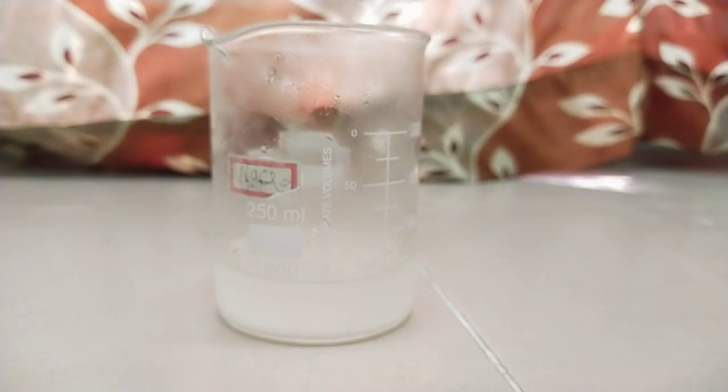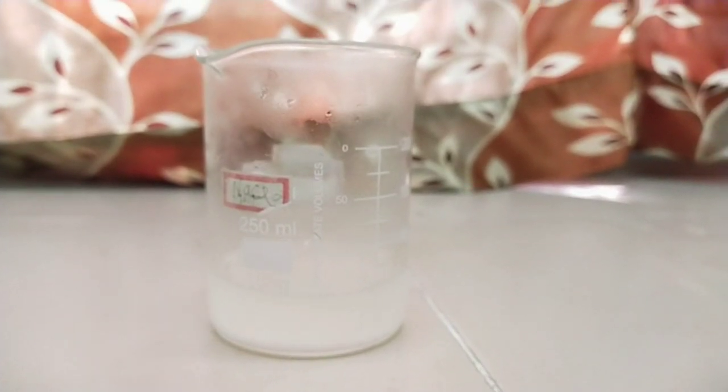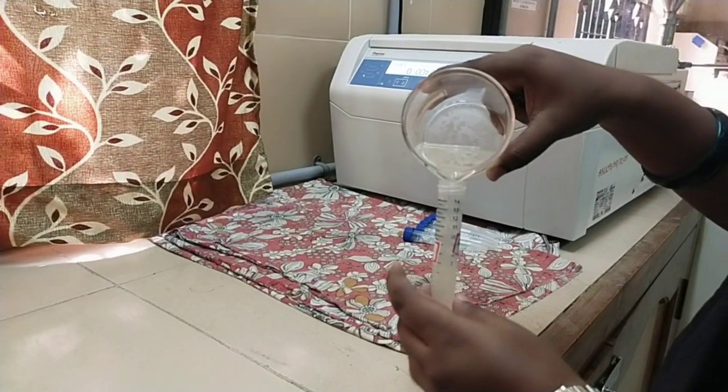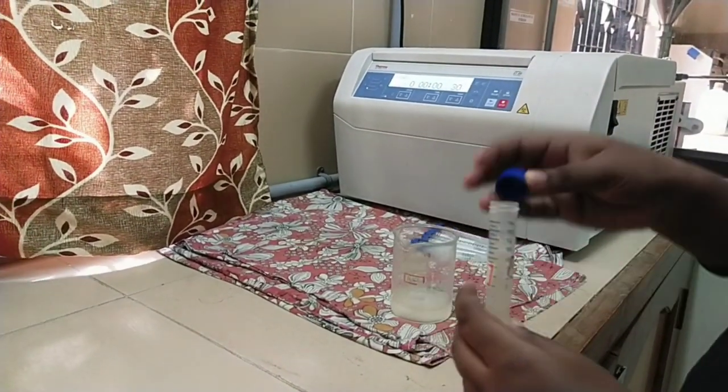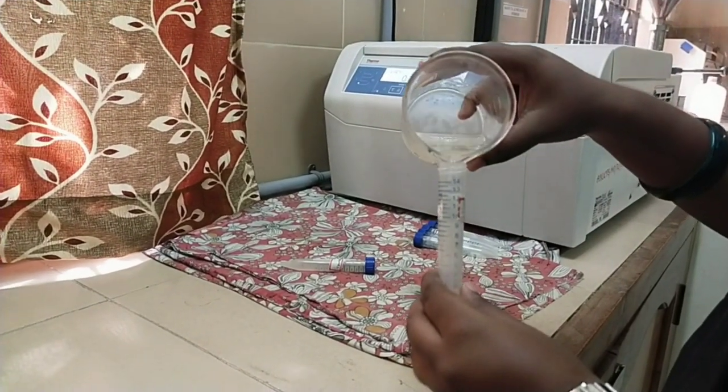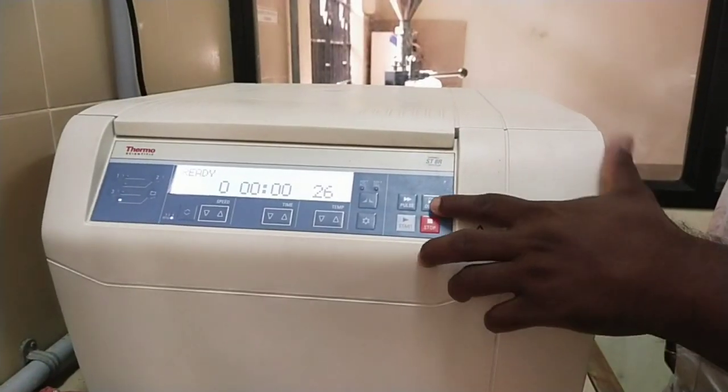Let us see how the solid is separated from a liquid mixture. First, fill the centrifuge tubes with the desired liquid mixture. Never overfill or underfill the tubes. Tightly secure the lid on the tubes. Now, for opening the centrifuge door, press the open key.